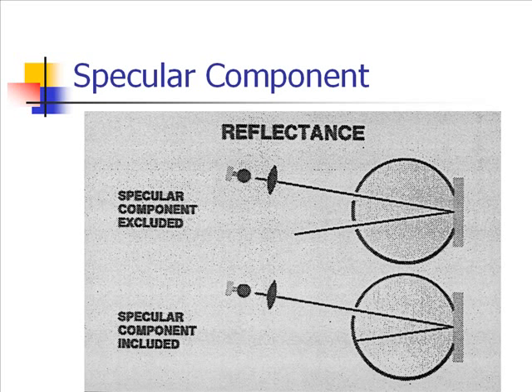So why are these different instrument geometries different? First thing we need to do is look at what makes up appearance of an object that we're looking at.